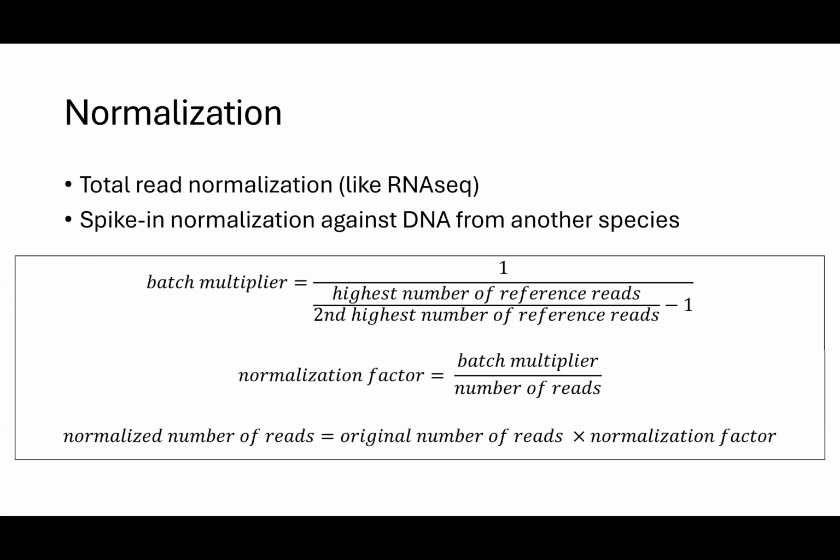Why is there a -1 there? That is a great question for which I do not know the answer. I'll get the link to the paper; they explain this in detail, and I don't know off the top of my head why it's got a minus one.